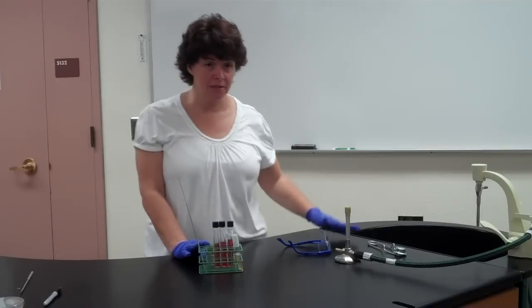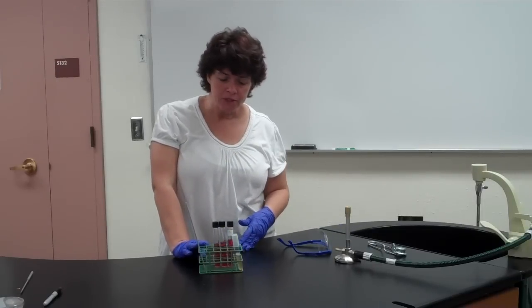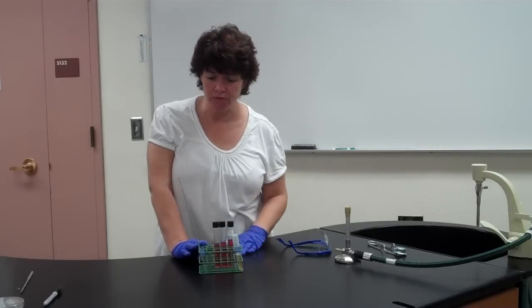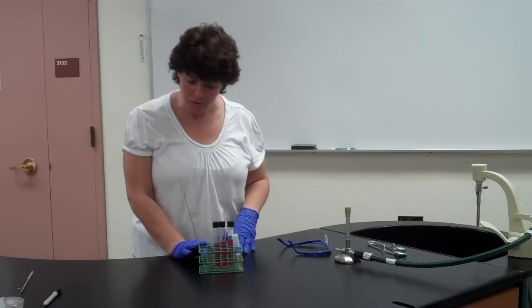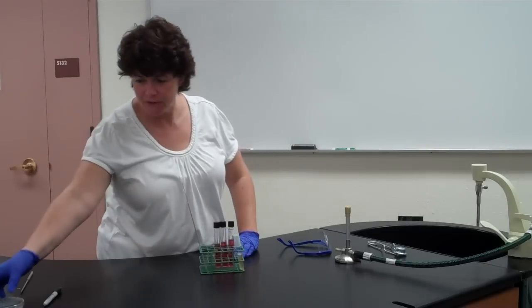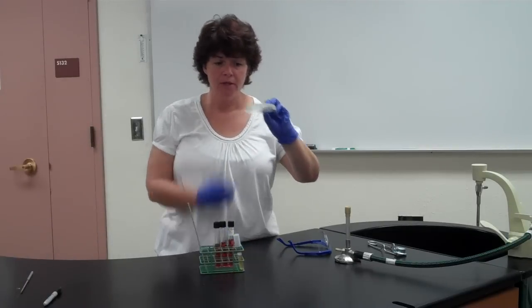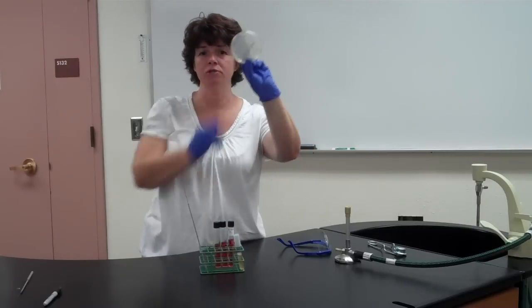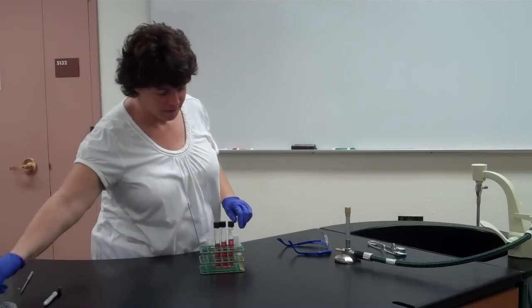Okay? And like I said in the previous video, you already had the 4 for the gelatin, so now we're adding on to tubes. And that's if we do 2 labs together, which you guys will be doing, and then some classes will be doing the other 2 also. The other thing I wanted to mention was in the previous video, I forgot to remind you that when you put plates in the incubator, lid side down, agar side up, otherwise too much condensation will form and you'll end up with swimming bacteria, which is really gross. You don't want that. Okay?